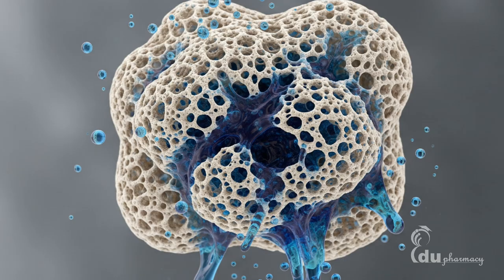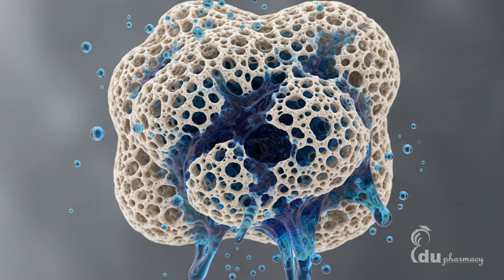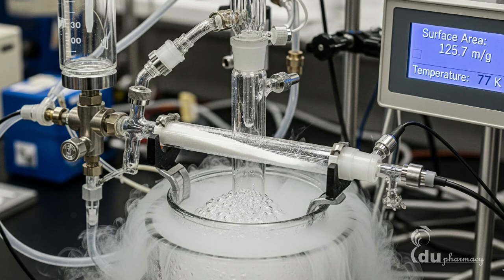Porosity also matters. A porous particle can absorb more liquid, which affects how it behaves during granulation or when compressed into tablets. To measure surface area, one of the most widely used techniques is the BET adsorption method.